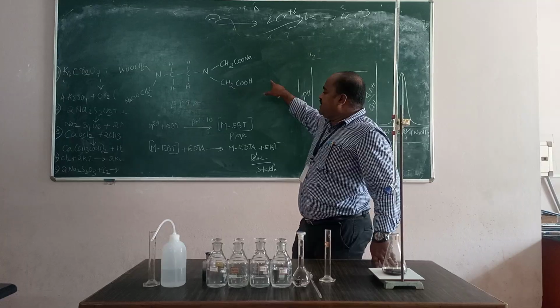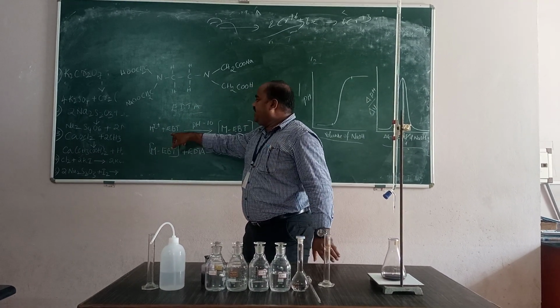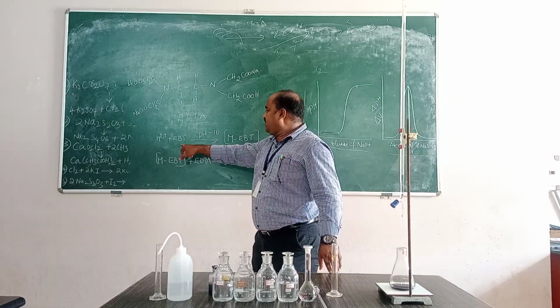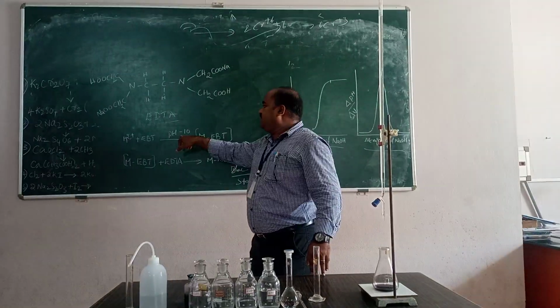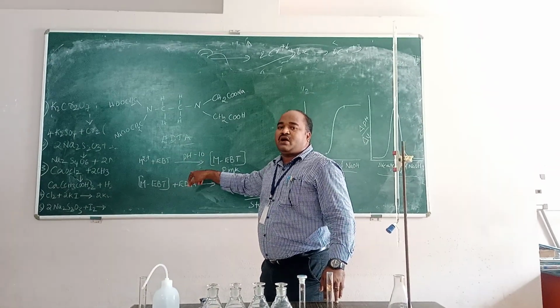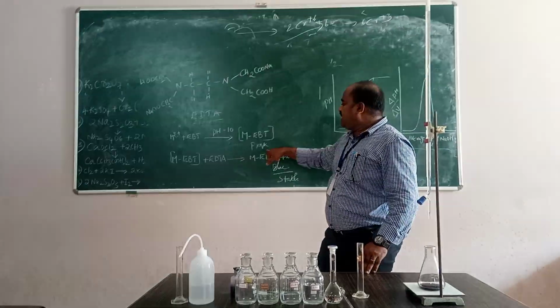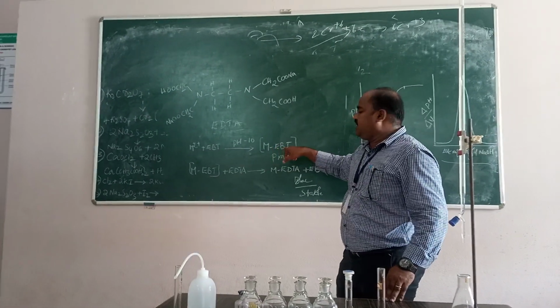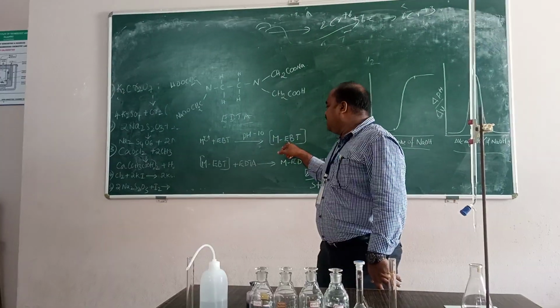First of all, our metal can bind with an indicator, eriochrome black T, under a pH of 10, which is a basic condition. We will use an ammonium chloride and ammonium hydroxide mixture, to form an unstable pink or wine-red complex of the metal with eriochrome black T.